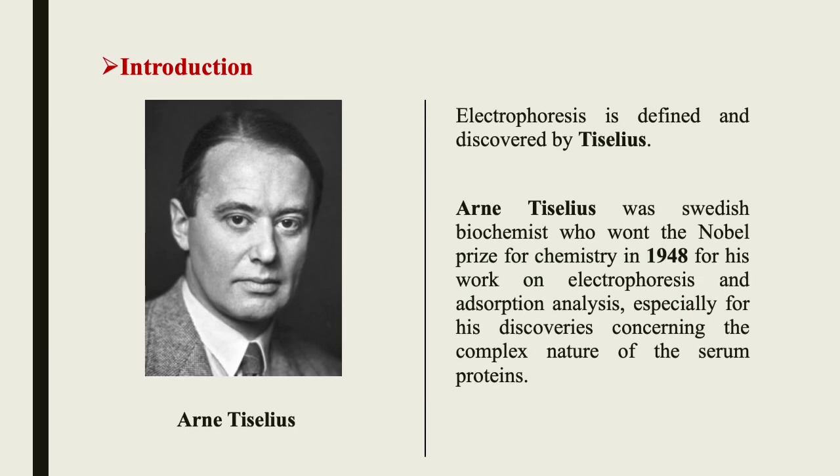First, let's get introduced to who invented the electrophoresis technique. Electrophoresis was defined and discovered by Tiselius. Arne Tiselius was a Swedish biochemist who won the Nobel Prize for Chemistry in 1948 for his work on electrophoresis and adsorption analysis, especially for his discoveries concerning the complex nature of the serum proteins. He invented this electrophoresis technique, and using it, he isolated the serum proteins.